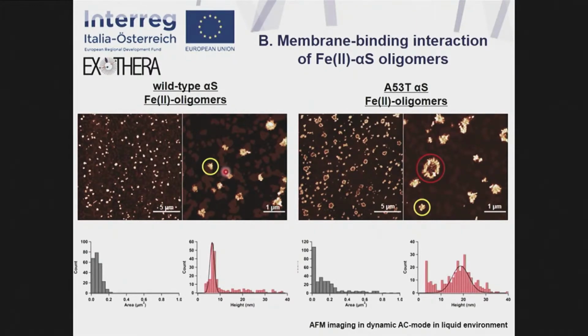So probably there is a specific nucleation of the proteins on the domains with the assembly of this kind of structure. And we observe an aggressive behavior of the mutated form, with the presence of these bigger clusters with a ring shape.